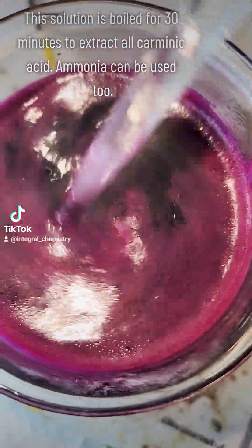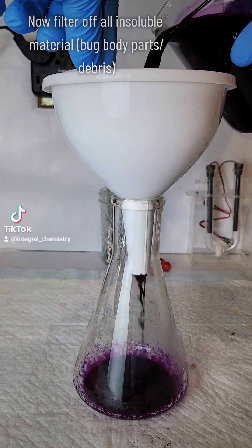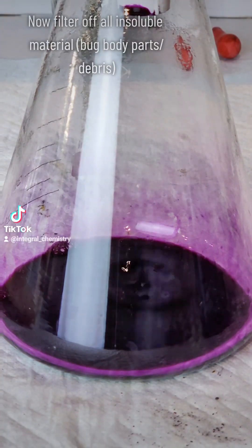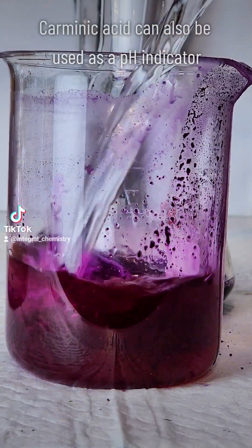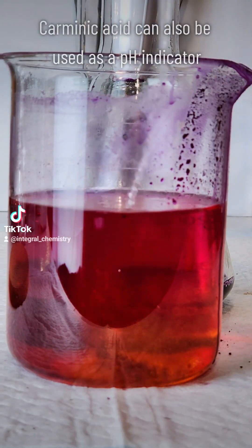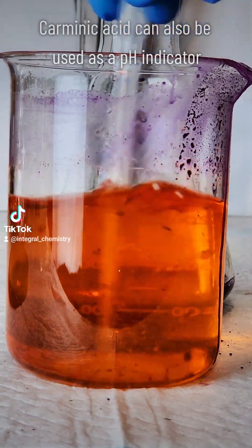This can be used as-is as a textile dye, but I want a pigment that can be used for painting. To do this I need to complex two carminic acid molecules to an aluminum atom, which will make the insoluble pigment carmine. This pigment is still used widely today, specifically in food and makeup products — if you see something with the ingredient natural red 4, you're eating bugs, which is not a problem; it's non-toxic and completely safe.